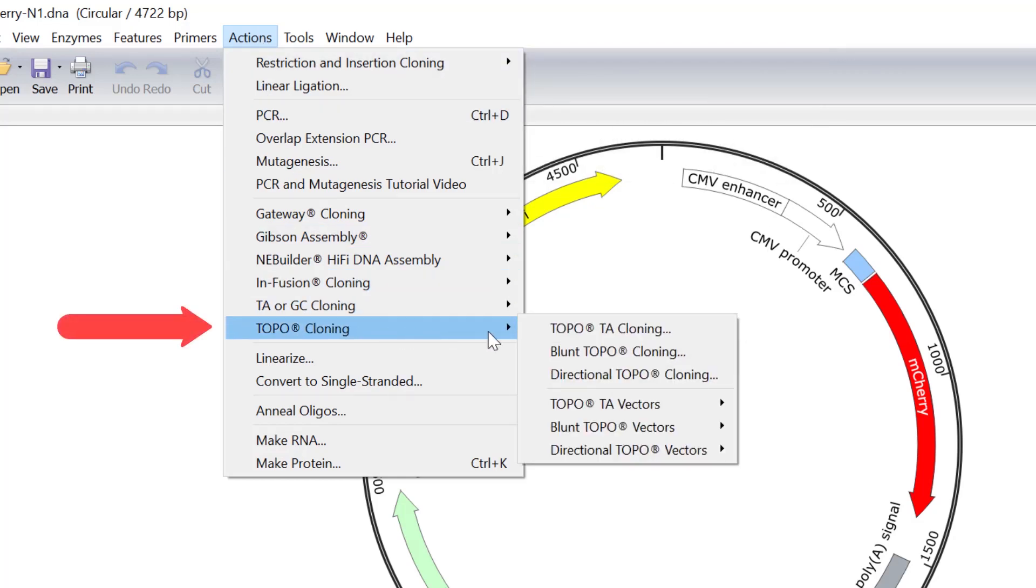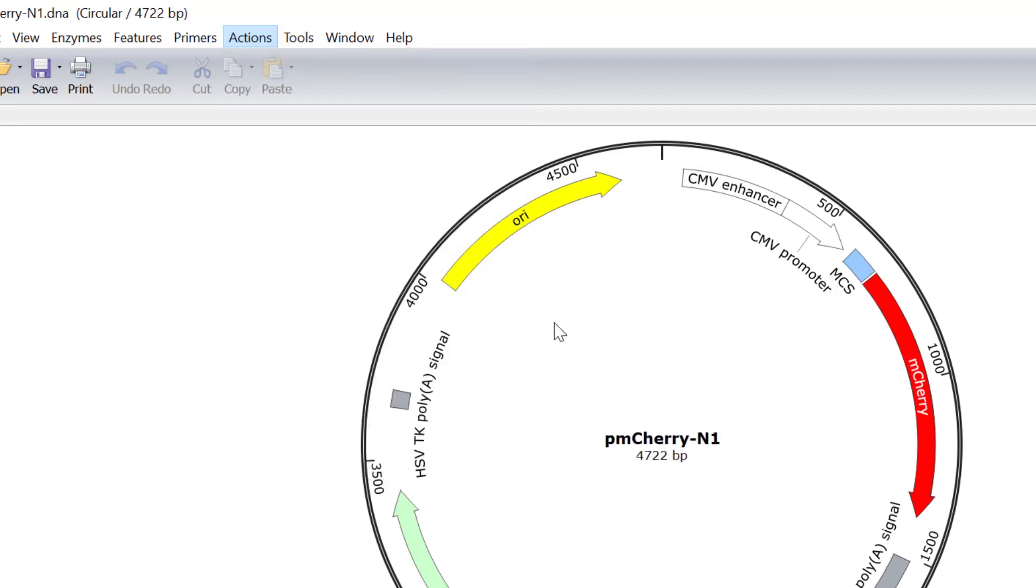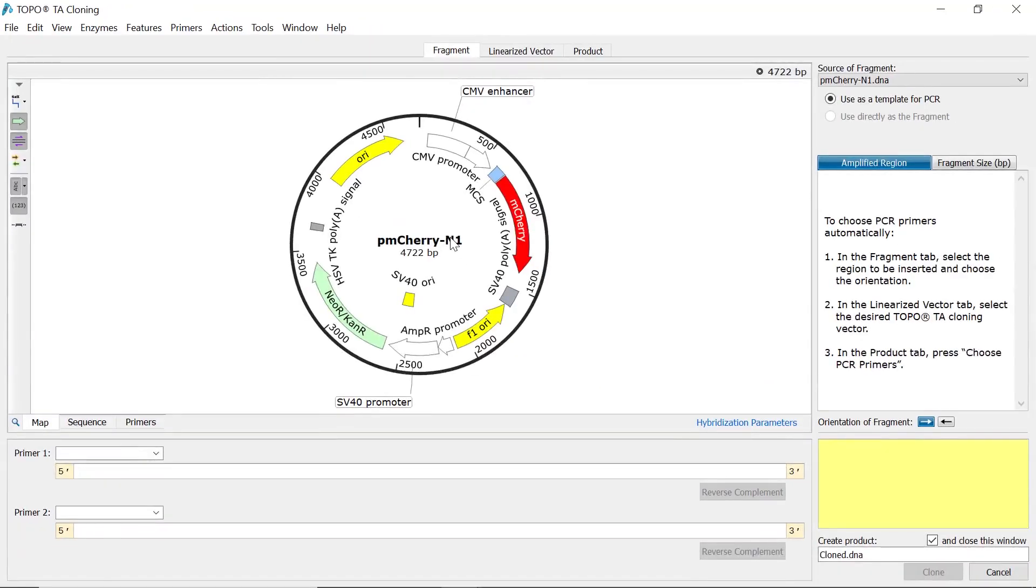For each topo cloning variation, the setup is very similar. In the new window, the first step is to select your insert fragment. If you already have a sequence file open in Snapgene before opening the topo cloning window, this will be set as the source of the insert.